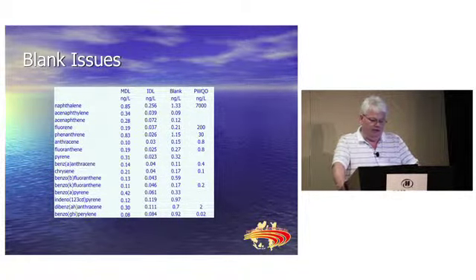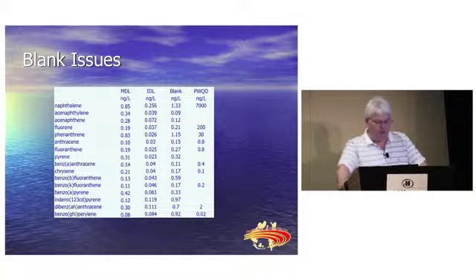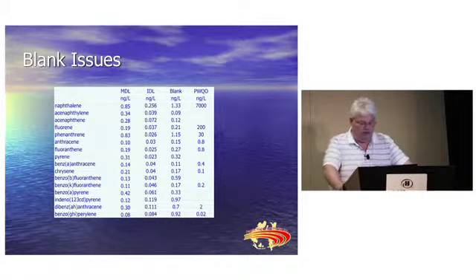When we looked at this, I said, great, we didn't spike any of these samples. Those were all real world, but were they really in the sample or not? And we looked, our instrument detection limit was all far below the MDLs we had calculated. But we looked in our blank that we had run with it, and we had positives for everything that we were looking for. And what we were trying to do is hit a provincial water quality objective that you see here on the very right.